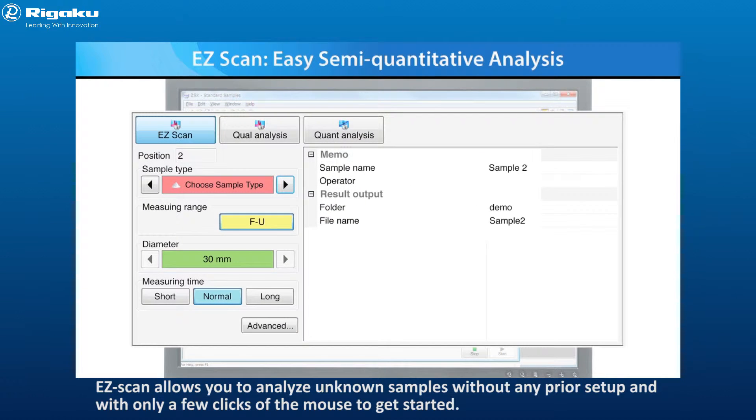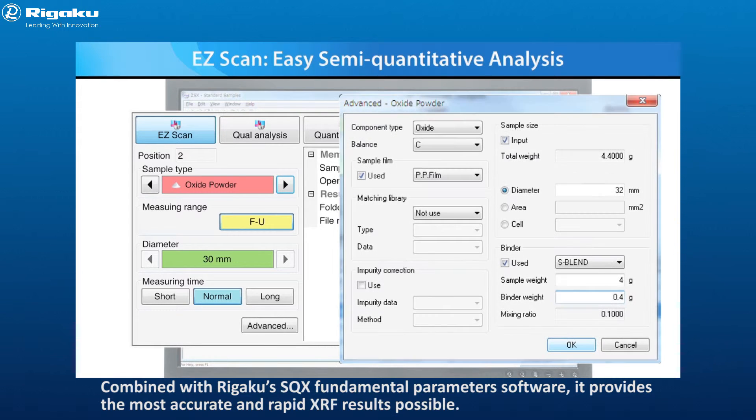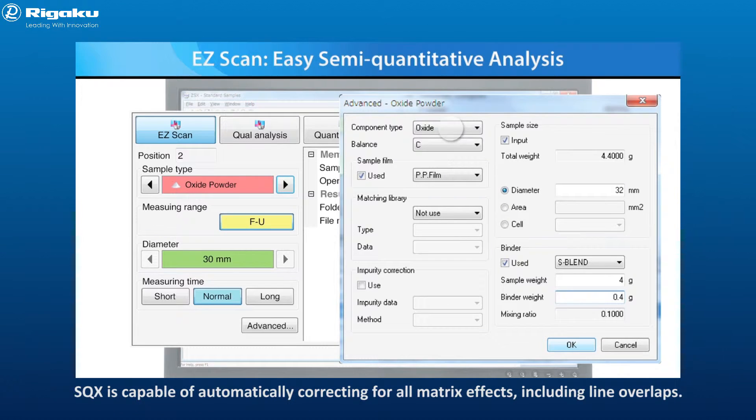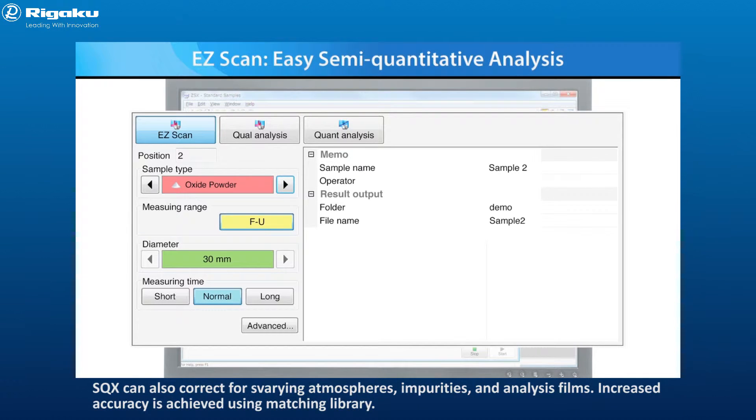Easy Scan allows you to analyze unknown samples without any prior setup and with only a few clicks of the mouse to get started. Combined with Rigaku's SQX Fundamental Parameters software, it provides the most accurate and rapid XRF results possible. SQX is capable of automatically correcting for all matrix effects, including line overlaps, varying atmospheres, impurities, and analysis film. Increased accuracy is achieved using a matching library.